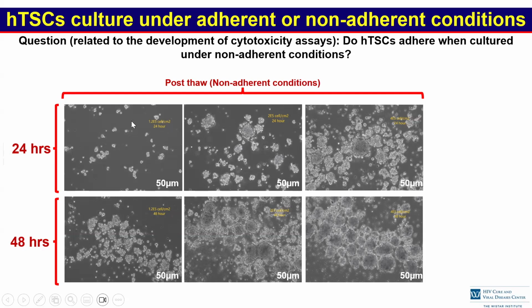We're not worried about this because our toxicity assays span 4 hours, so we never reach culture of the cells up to 24 or 48 hours, but we just wanted to try. We also want to see what the effect of the number of cells in the culture is, and how this affects the trophoblast cells under non-adherent conditions.